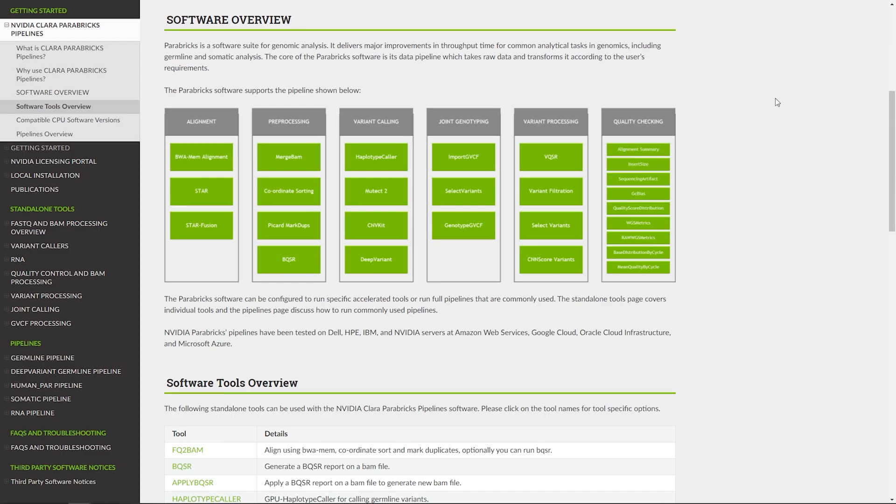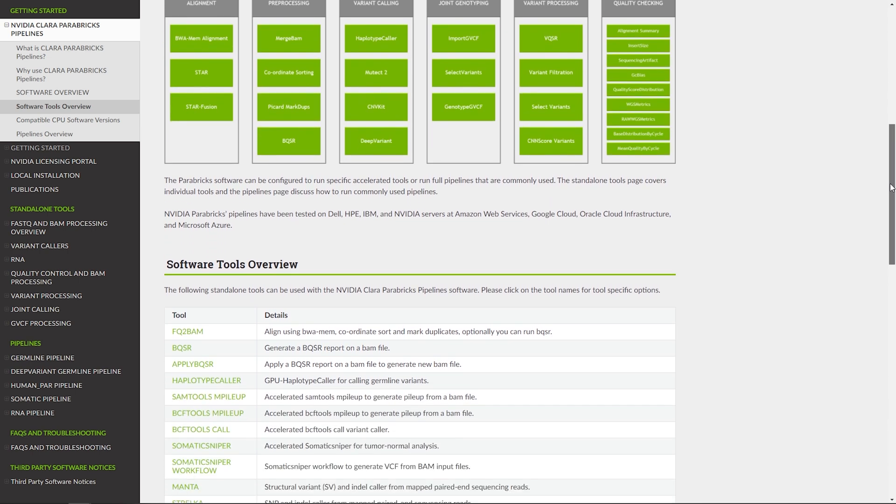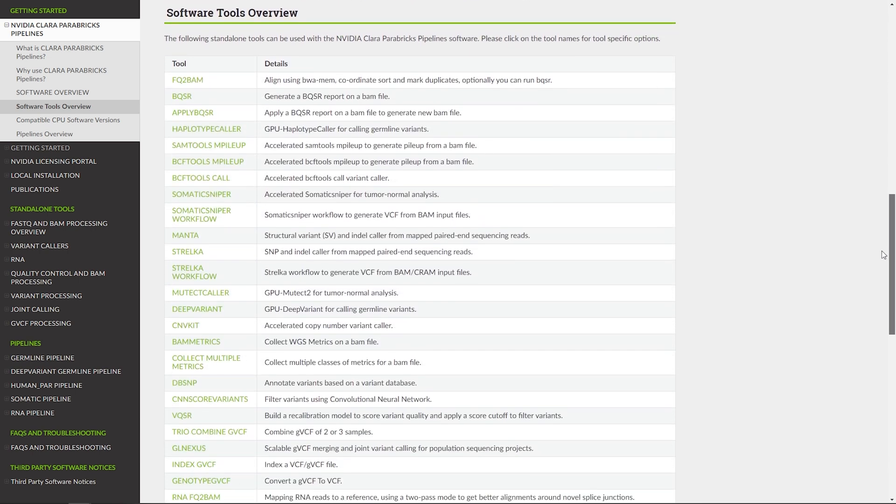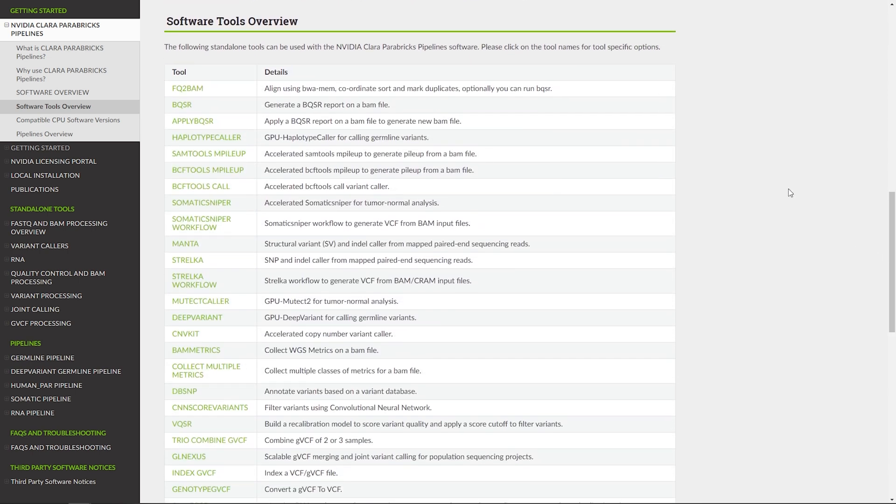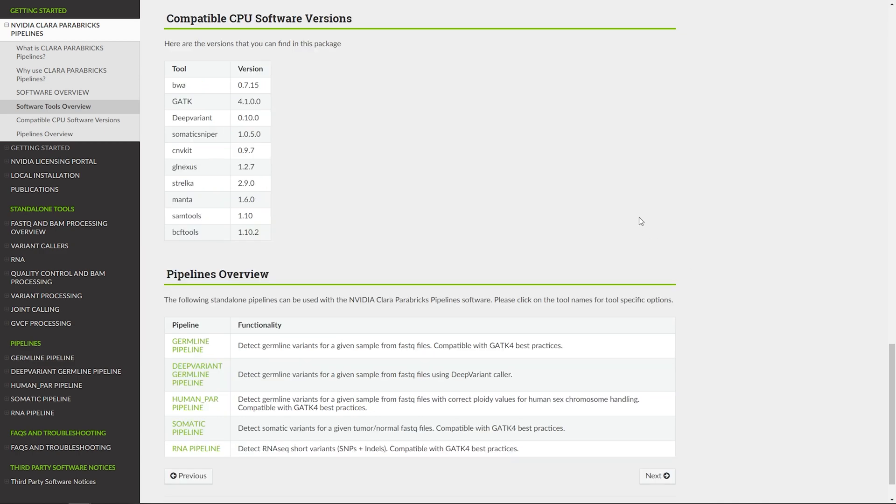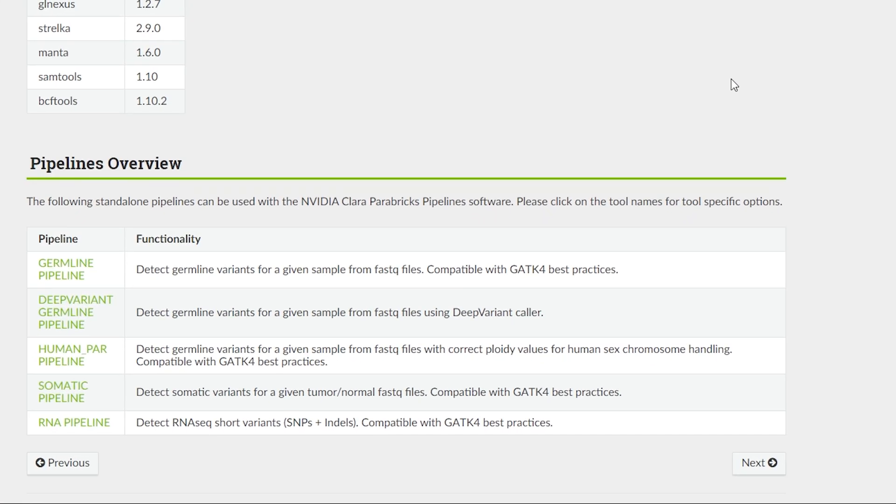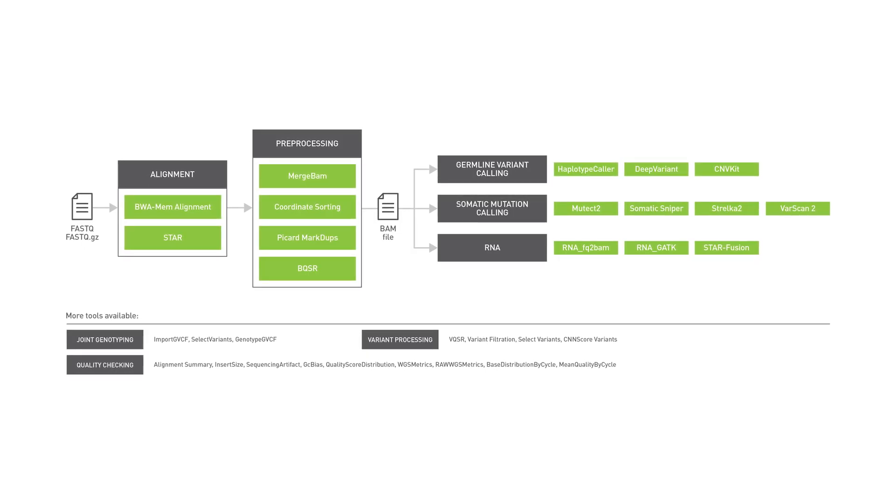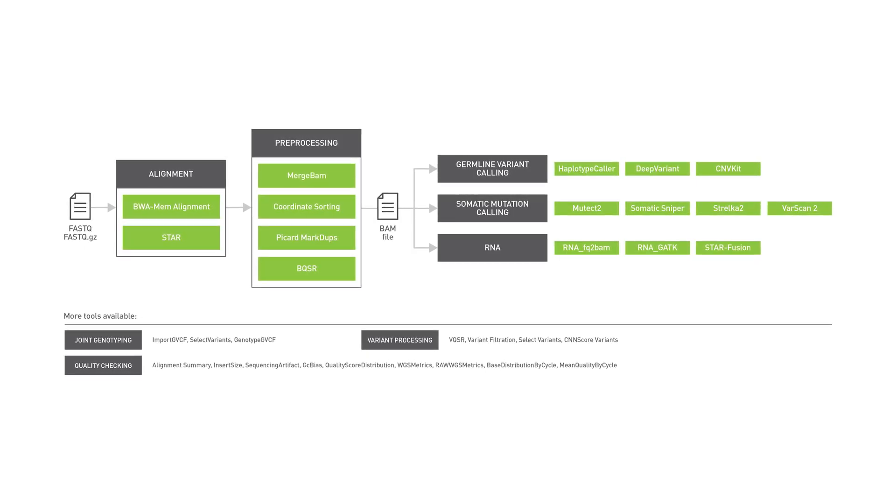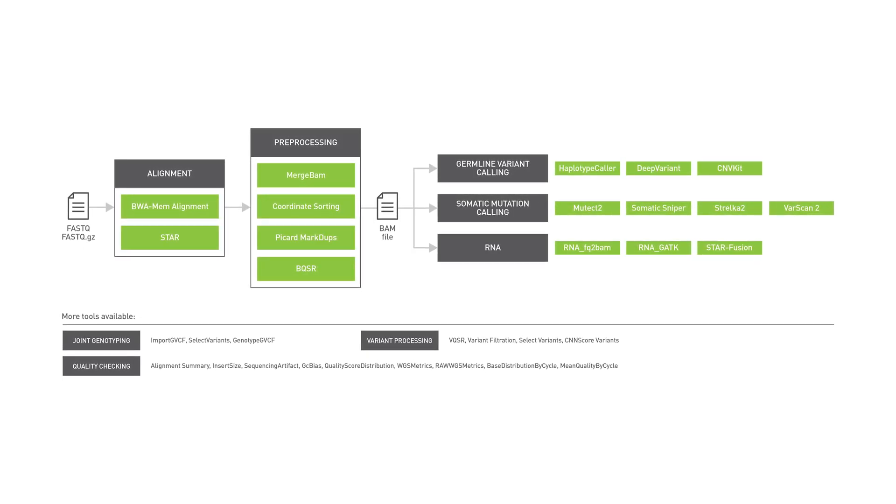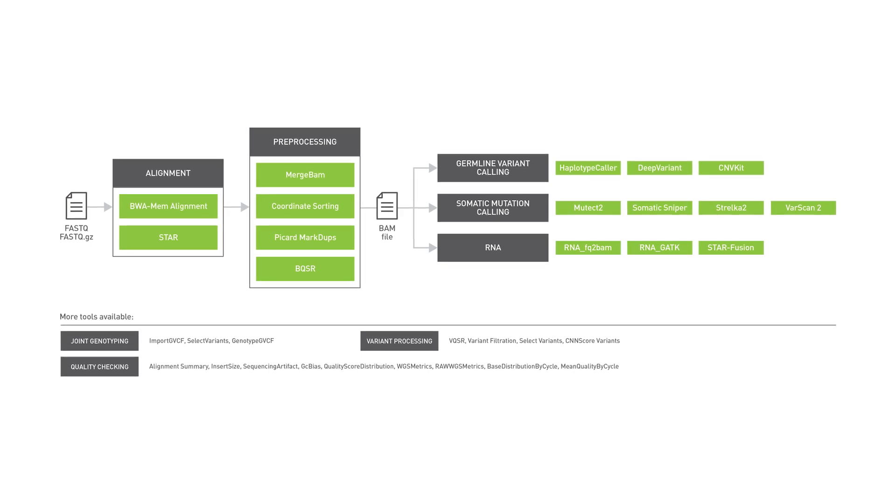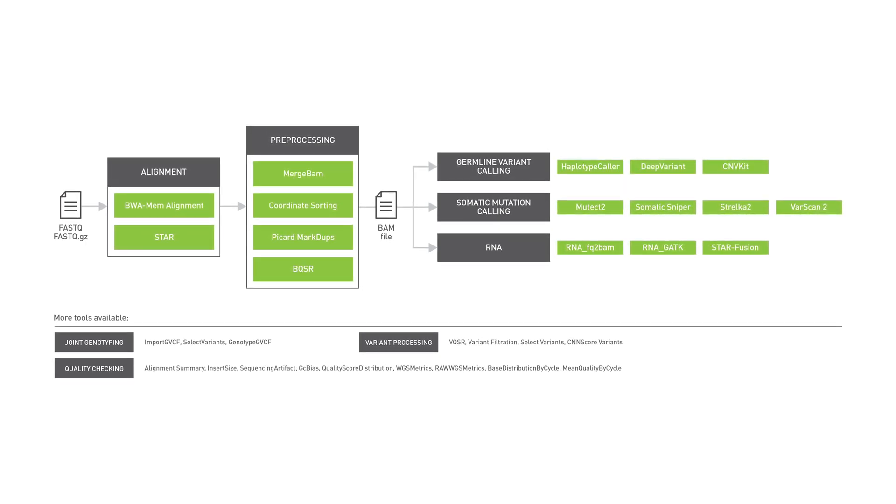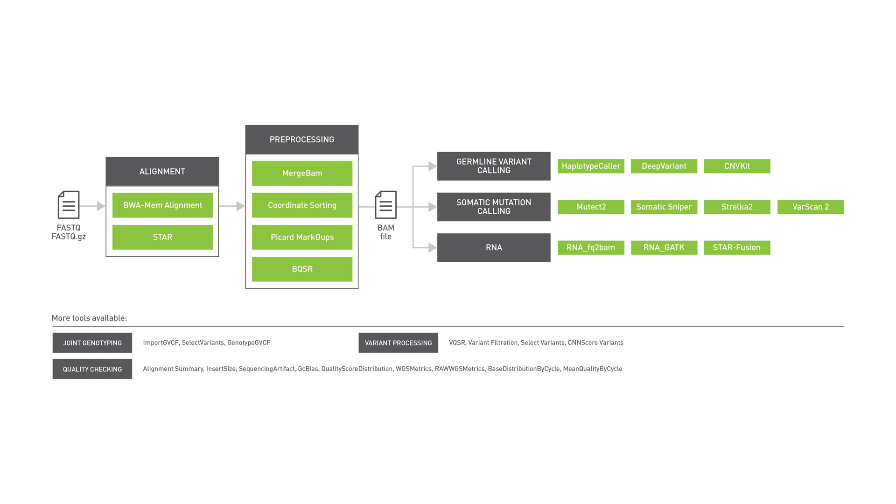Full documentation for all Parabricks commands and options is available at Tools Overview tab. The Parabricks software suite can run germline, somatic, and copy number pipelines end-to-end. It also includes accelerated quality control metrics. This graph shows the different tools that are supported and their options.